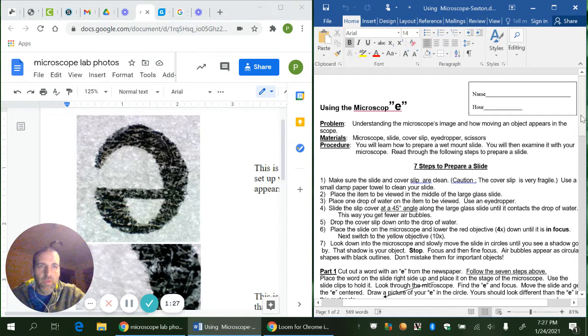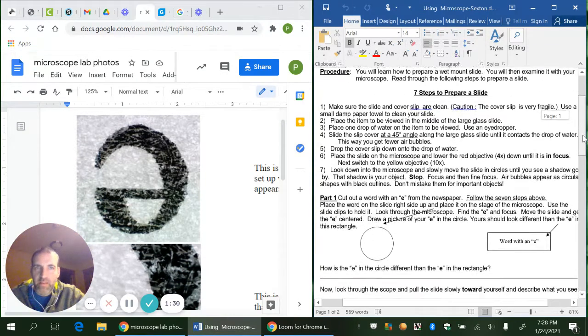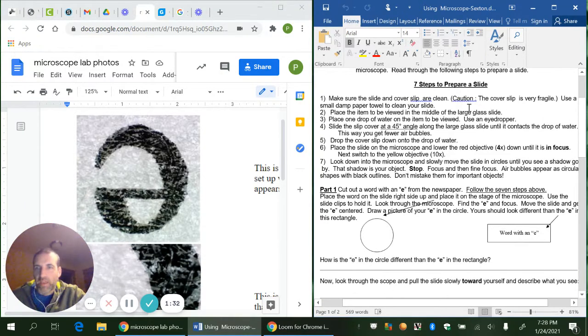So when we started off in this activity, we went over the steps for making what's called a wet mount slide. And that's going to be a slide that uses water or some type of dye or stain to suspend what you're looking at under the microscope. We always want to start with a clean slide. We're going to put the item we're looking at on the slide. You're going to put a drop of water, or if you were using a stain, you would use a stain onto your slide. The slide is just a rectangle of glass generally.